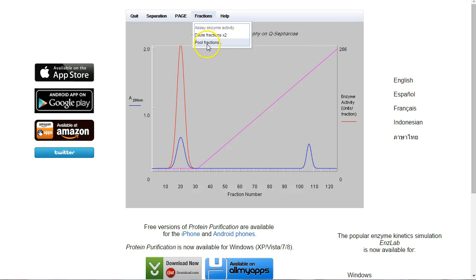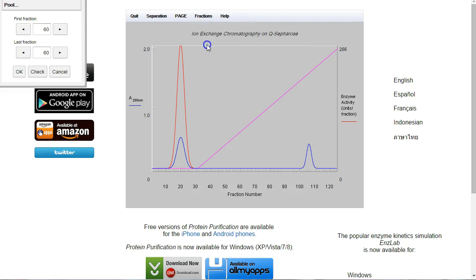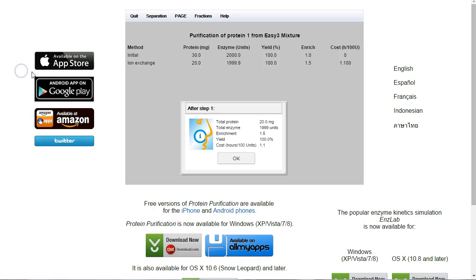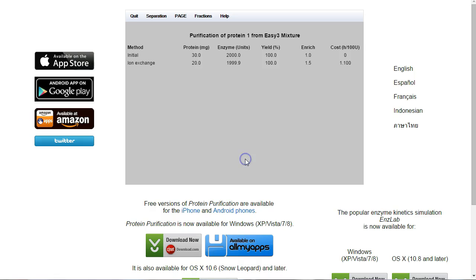So the next thing we want to do is pool those fractions. We're going to take all of the fractions between 10, which is here, and 30, which is here. If we click on OK, that's pooled them for us. So now we've got 20 milligrams of protein, and it's 100% yield. So we're doing really well on this.